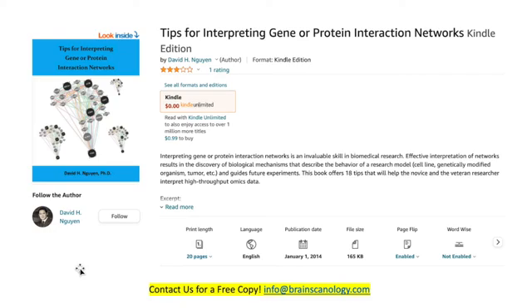The problem of having gene expression data that comes from two treatment groups that look the same phenotypically to the naked eye is very common. And shape analysis, as I've shown you in this presentation, is one way of correlating phenotype with changes in gene expression.